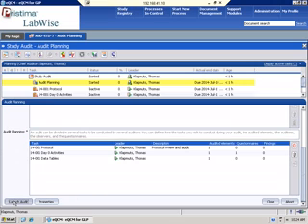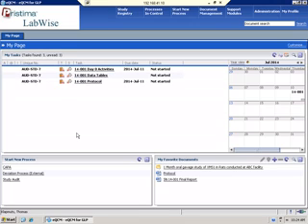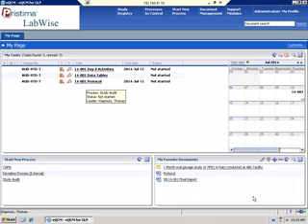So once I've got everything done, I can go ahead and launch my audit. What that's going to do is send everything out. Now when I refresh my page, because I'm the auditor, I have all of the tasks. So here's my protocol audit, my data table audit, and my day 0 activities.